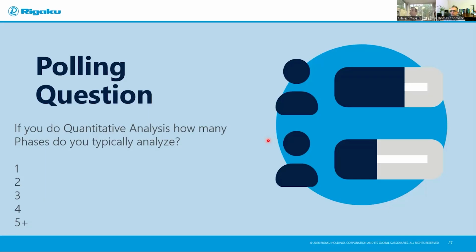Tom? Okay. Thank you. And then the second one here is again from the same user, is when you're doing a quantification of amorphous content using internal versus external standard, how would these two compare from an error standpoint? Which one would you think would provide more accurate results, internal versus external, for the amorphous content?